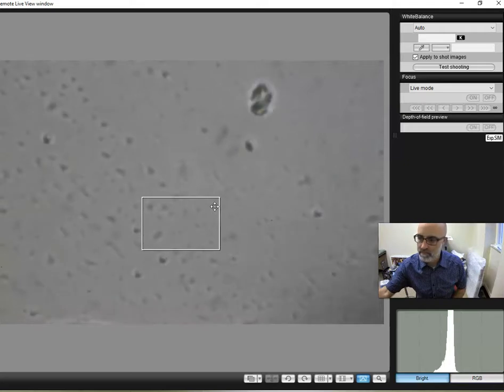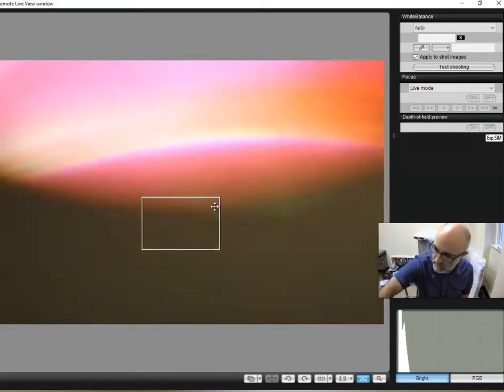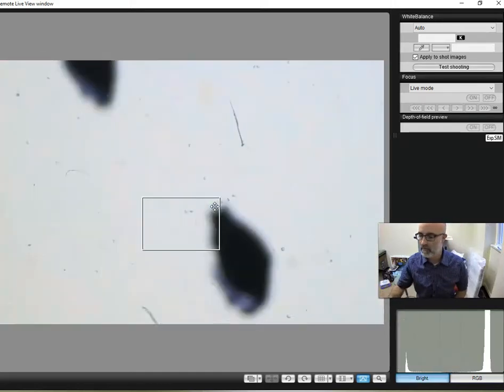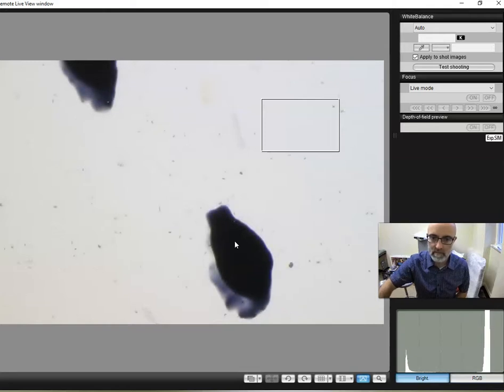Okay. The other thing that's the issue, I didn't follow my own rule. I did not start out on the low magnification. Okay, so I'm going to flip down to the red 4x. Boom, there we go. Now we see, what are these little black specks here? That is our markers for where the specimen is. Focus, there we go. Oh, beautiful.